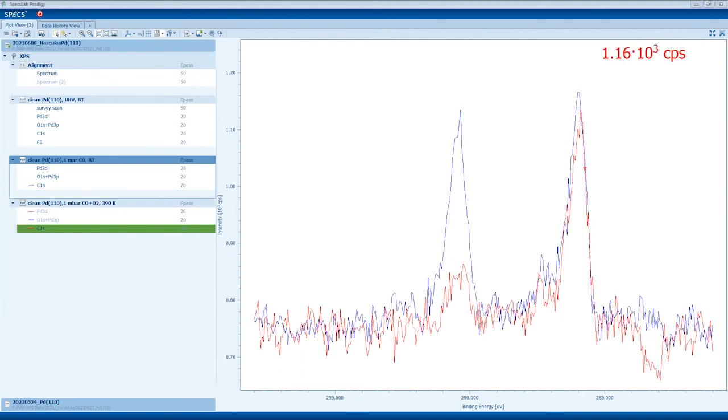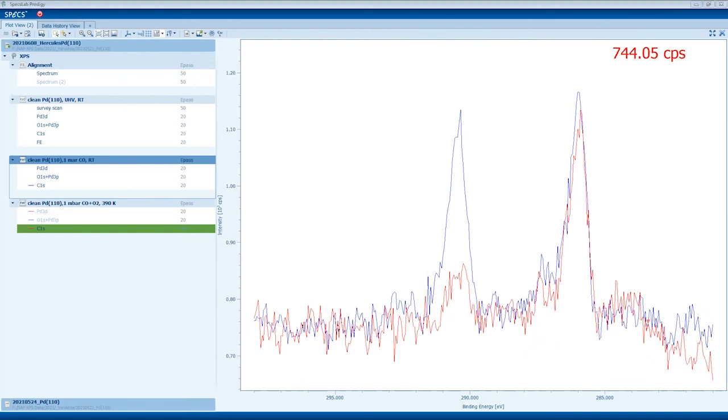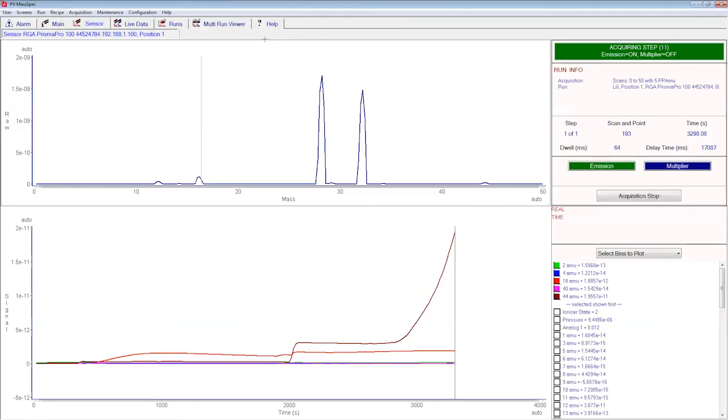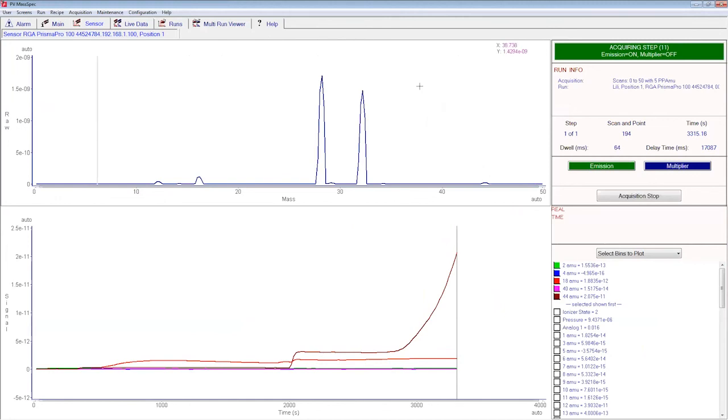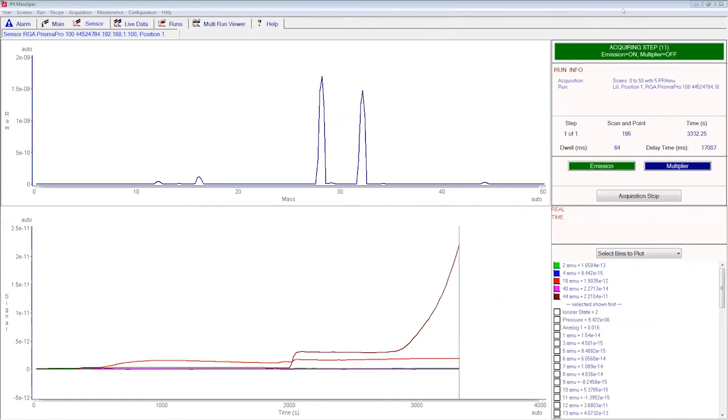But even with lab-based setups, we can measure many things. We saw examples. As you can see now, it's actually visible, even the production of CO2. We increased the temperature to 200 degrees C, and it already starts to really react. The CO is consumed together with oxygen, and you can see that CO2 is produced. Now at 200 degrees C we retrace the sample a little bit to get it to the right position, and it works.